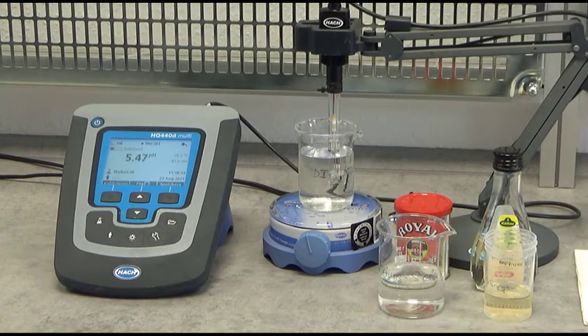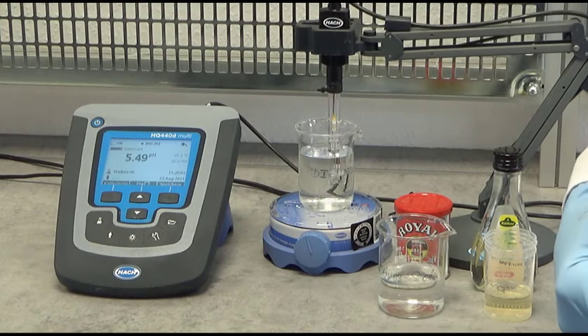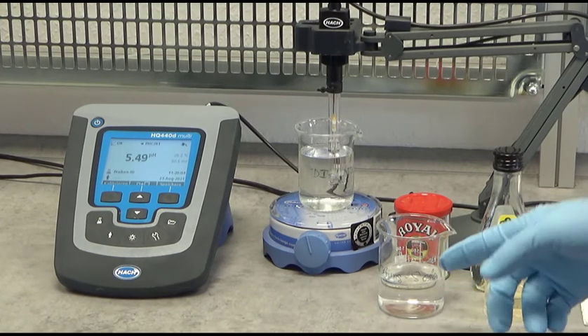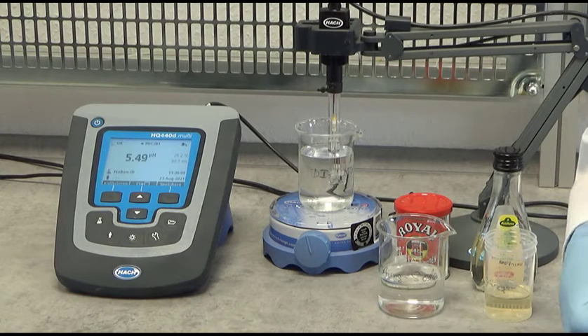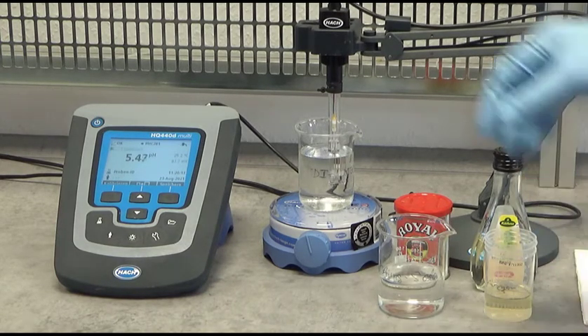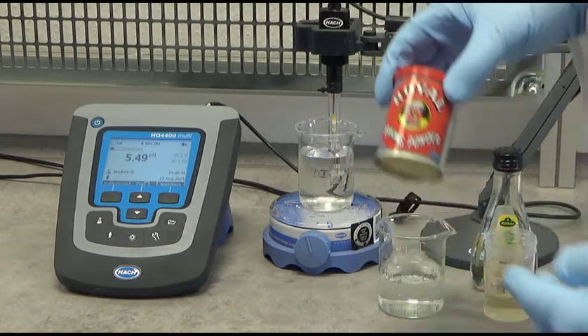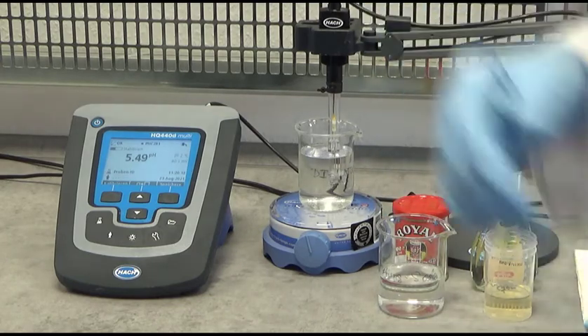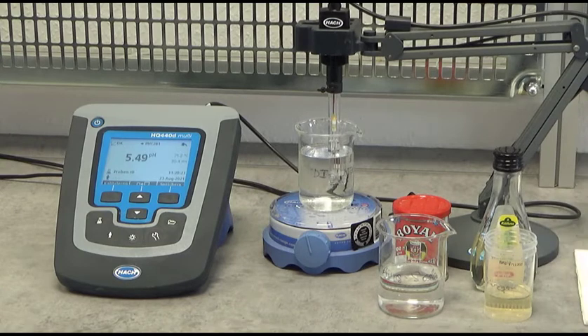For this demonstration, I prepared two beakers with a water sample. Beaker number one contains only deionized water, and beaker number two contains deionized water with a little bit of baking soda dissolved in it. Baking soda, chemically speaking, is sodium bicarbonate. So we have some bicarbonate in the water that contributes to the alkalinity of the water sample.